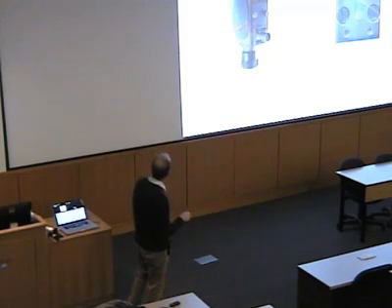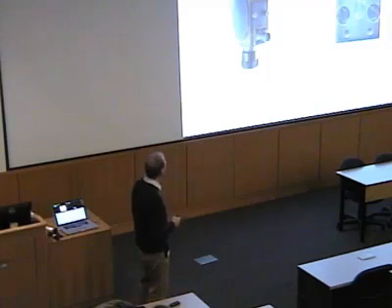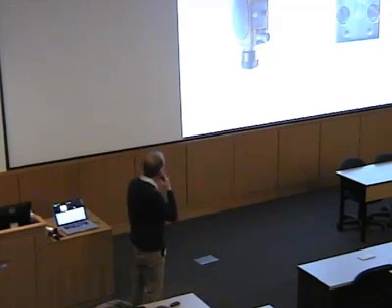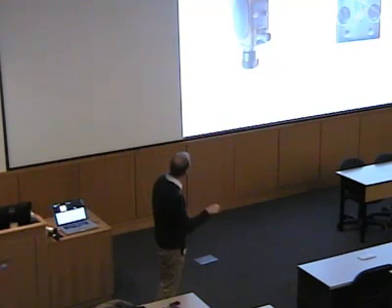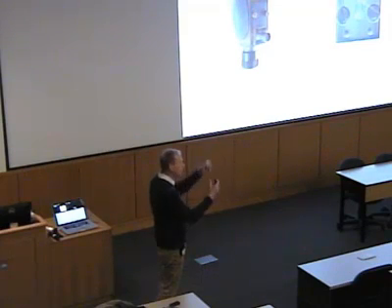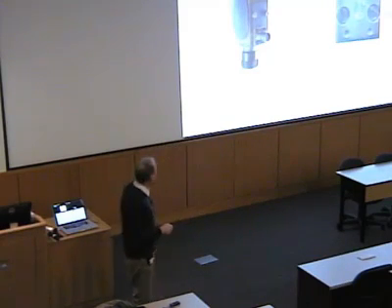The sample would be sitting inside here. We bring the microwaves down into the cavity, and we want to set up this resonant or standing wave within the resonator. We couple the microwaves into the resonator using a slit. This plate here that we're looking at would be at the back of the resonator, at the place where the waveguide meets it, and we put a slit there that allows the microwave to pass into the resonator.